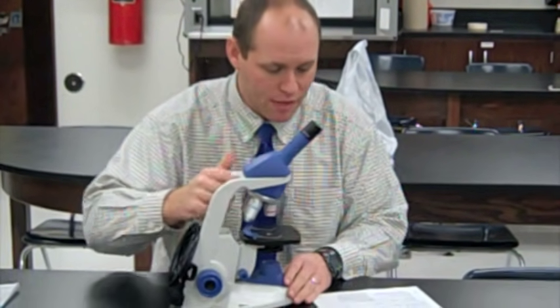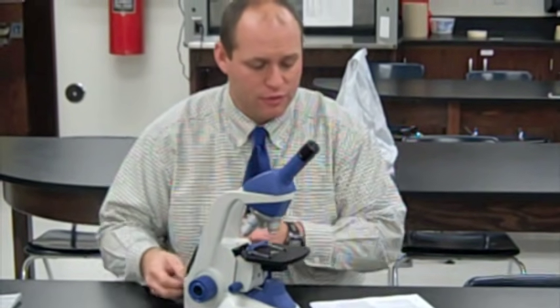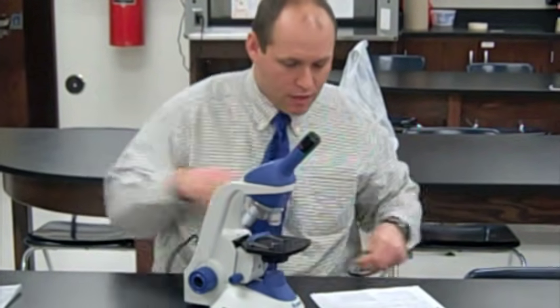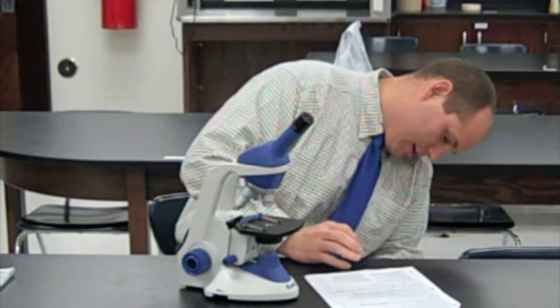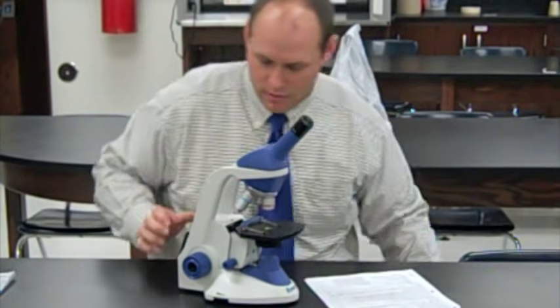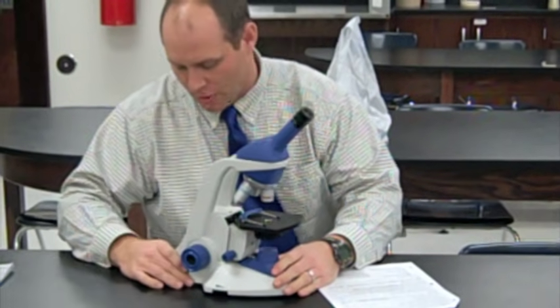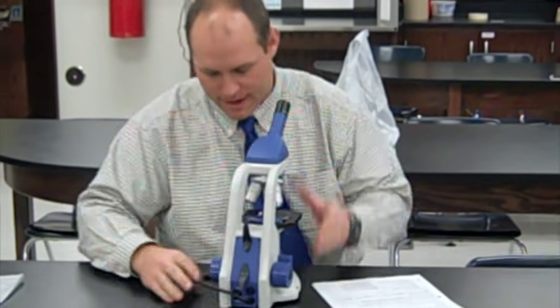if you did. Next, you're to unwind the cord and plug it in, and adjust the arm and the scope so it's close to you and comfortable while you're actually focusing. Just plug it in here. Okay, so try to get the cord out of the way. With the newer scopes, you do have to switch them on. The older scopes, you do not.